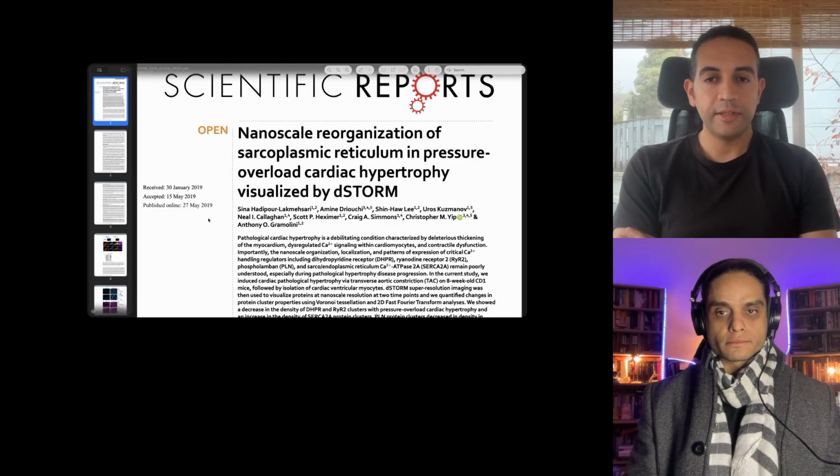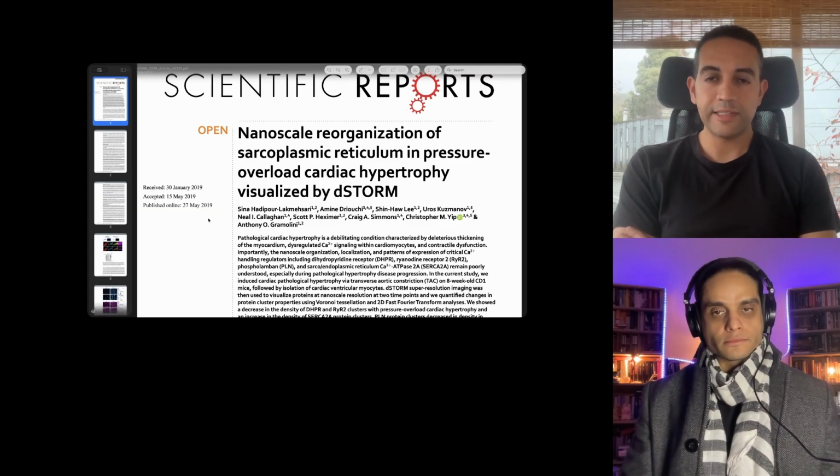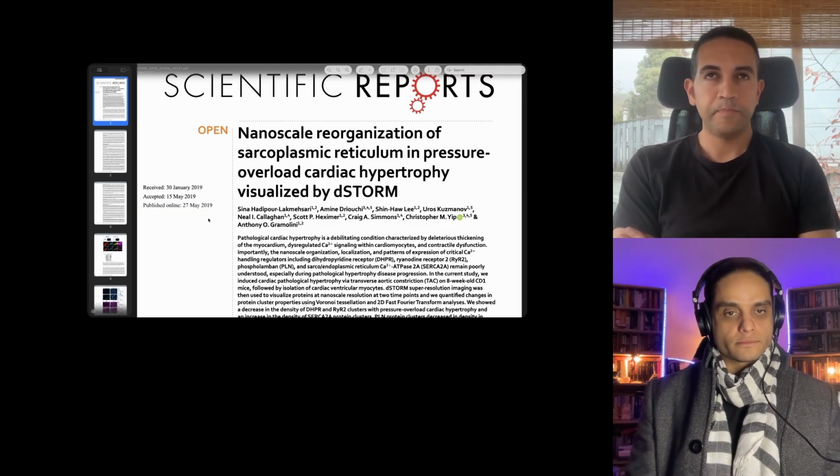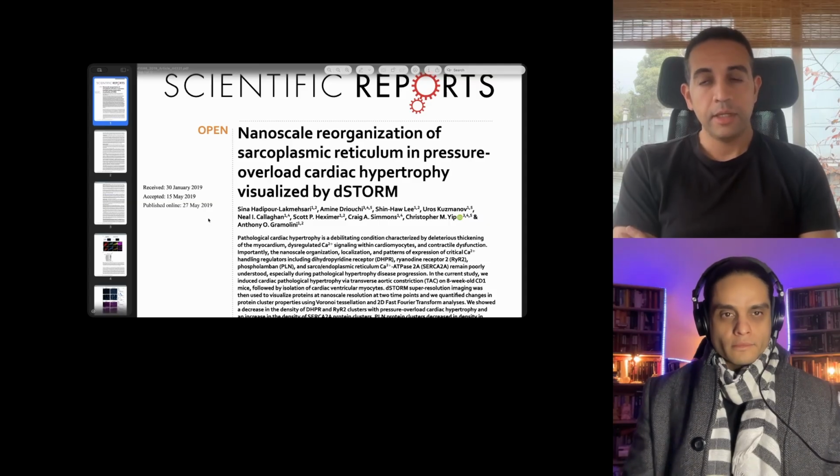Maybe something they did not really talk about earlier is that all these methods are great in 2D, in X and Y, but the Z dimension requires a few more optical tricks. You can use a cylindrical lens to intentionally misshape your point spread function to capture where the spot is in 3D.